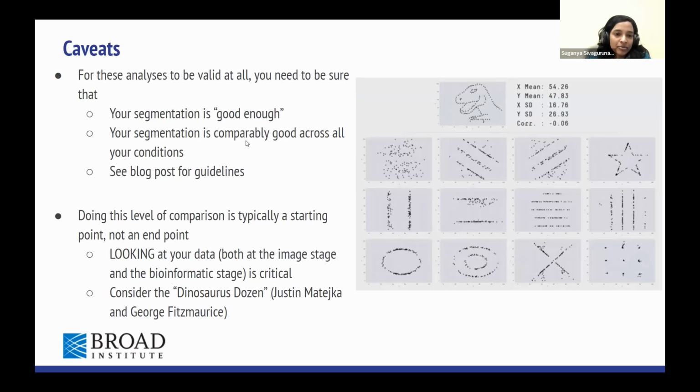But how do you say when the segmentation is good enough? I have linked a blog post in the resources slide in the slide deck, which you can use as a guideline for saying whether the segmentation is good enough or not.